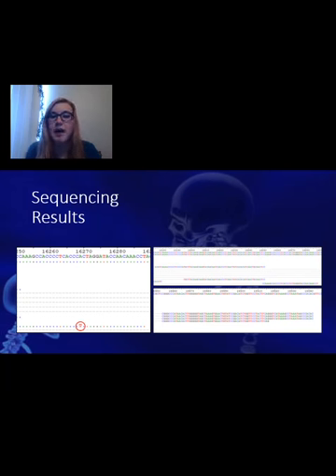This is depicted in the top right image where it is aligned to the Cambridge reference sequence. In the bottom right image, rescue PCR samples 1A, 2A, 3A, and RE-2 successfully amplified and sequenced with reverse primer 00018, and this was aligned here to the Cambridge reference sequence. There were no polymorphisms detected for these ones or the ones depicted in the top right.